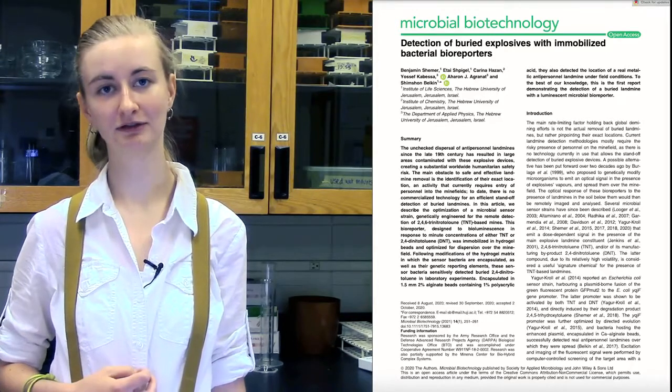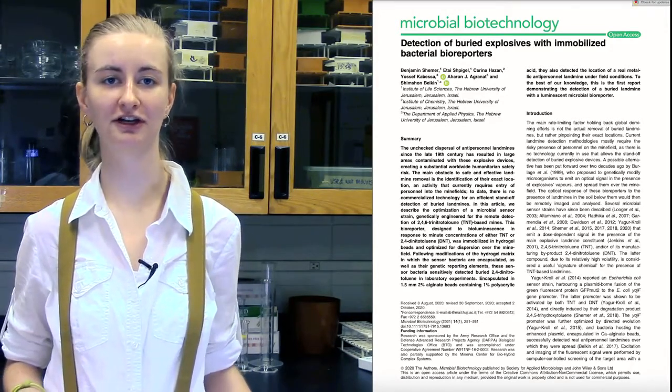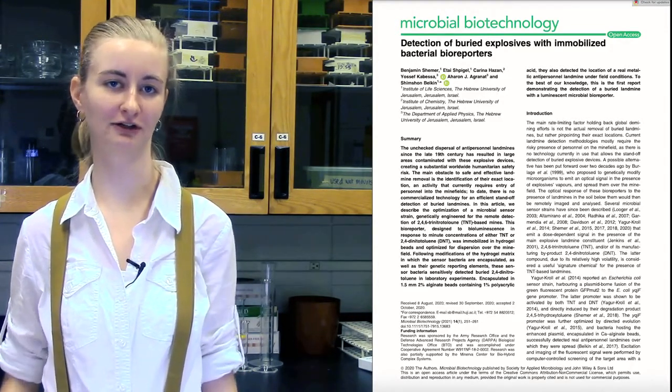Why is this important? Well, let me tell you about the super cool study where scientists used a stir bar in their research.